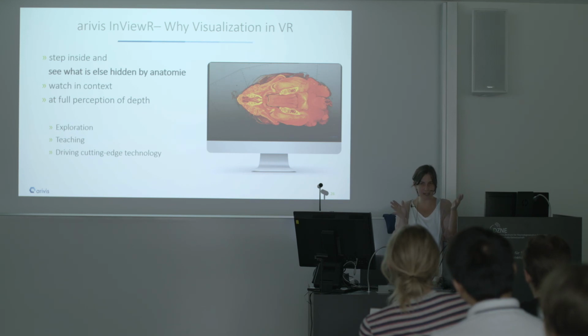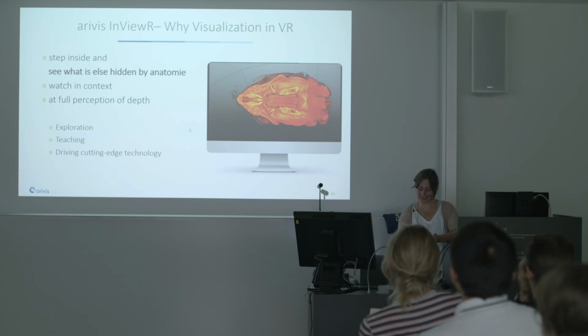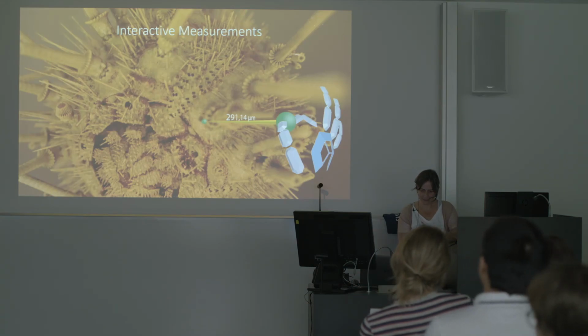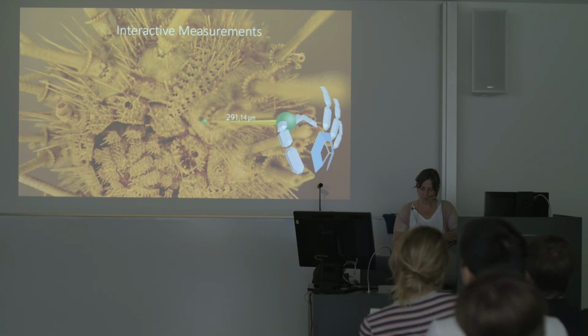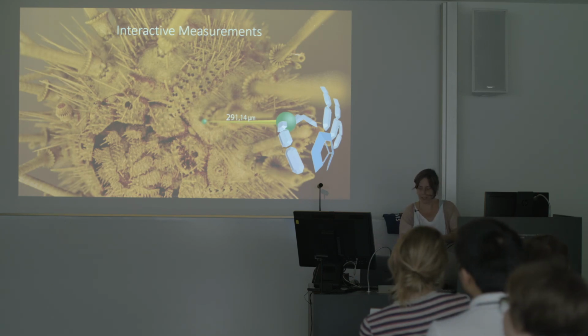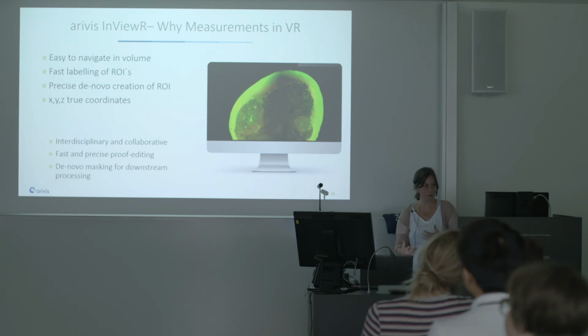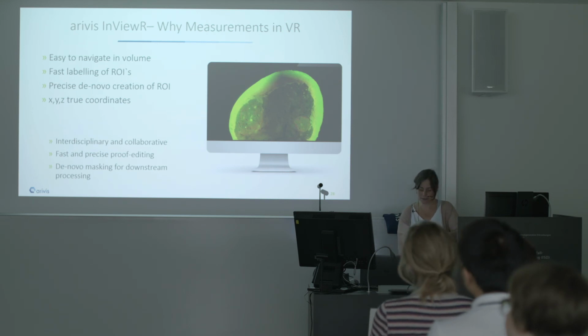So you're inside the data, and with the tools you're going to see, you can really navigate inside the data. There's also an extension to that, which is probably more of a reason for you. You can do measurements in VR, and you can do so very precisely. You can nowadays also annotate regions of interest, and you can create de novo segments. So you're going to see that live.